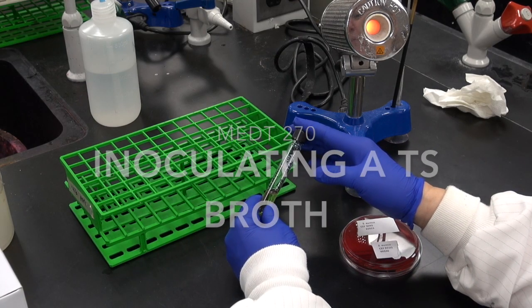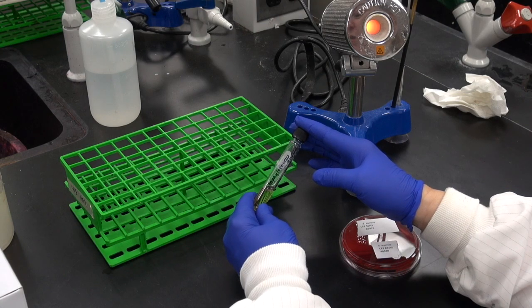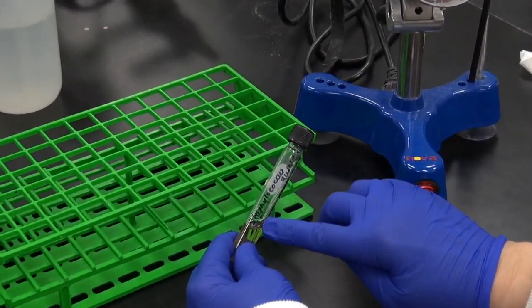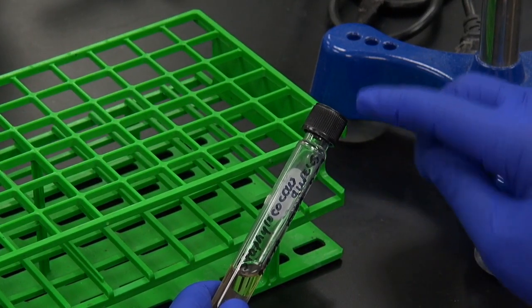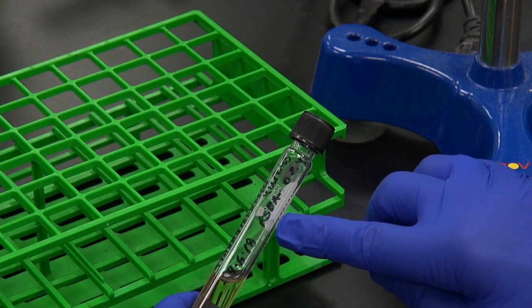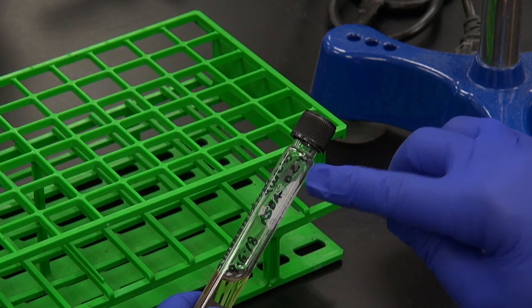This demonstration shows how to inoculate a fresh broth from a culture plate. We start with a fresh tryptocase soy broth labeled with the full name of the organism, the date, your initials, and your section number.